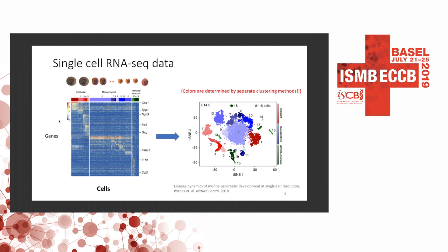And I want to mention one thing here is that these colors for the cells are determined by a separate clustering algorithm that Rhonda mentioned earlier. And if you have more interest, there are a lot of talks online you can see about how to do single-cell clustering. So we won't talk about that in detail in this tutorial. Here, I put this color so that you can see better how the cells are grouped into clusters by visualization.